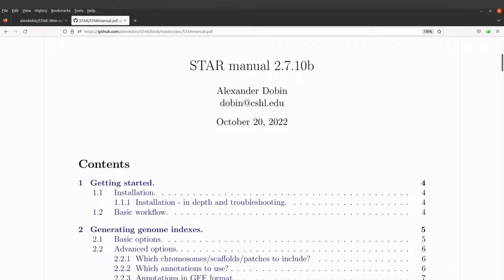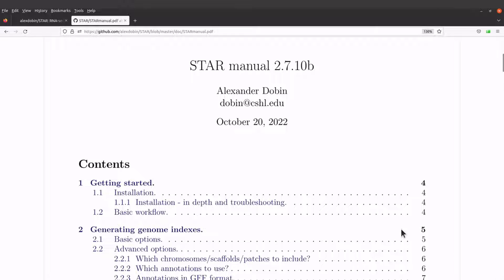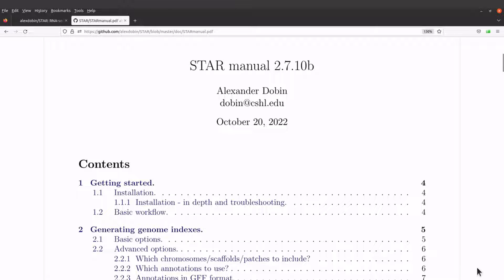For those who don't know, STAR is a tool that is used to align or map RNA sequences to a reference sequence. It's a splice-aware aligner, so if you want to read more you can download this manual here and then use that to get the basics.